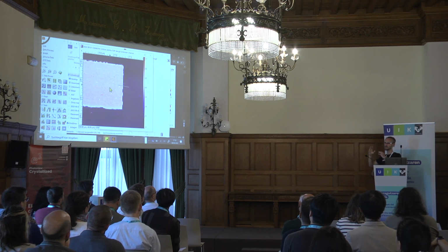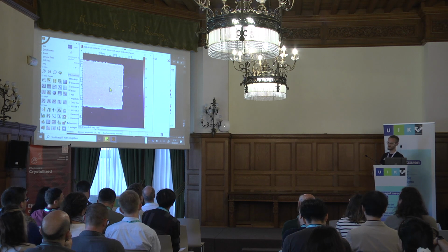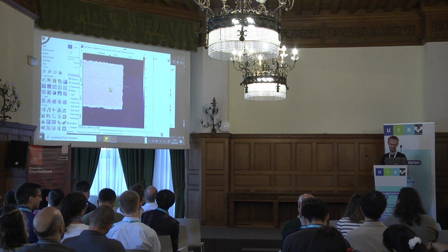But if there are multiple ones, then maybe this algorithm is doing something strange. And it's not Gwyddion's responsibility to take care of this. It's your responsibility. And also, if I say now you can click this button, I'm also not responsible. You have to always double check.